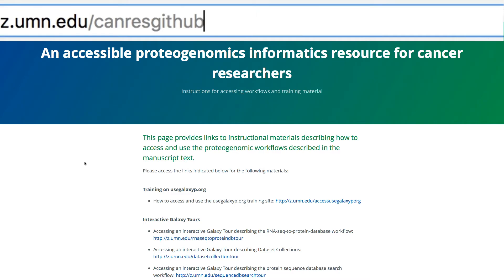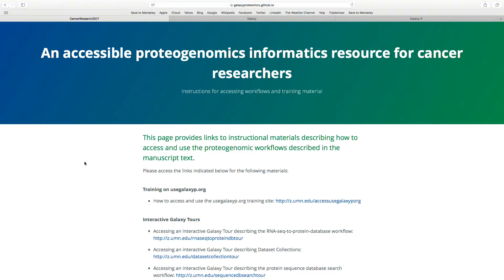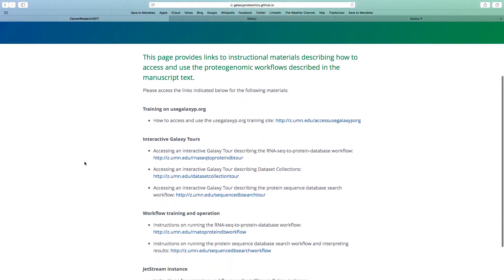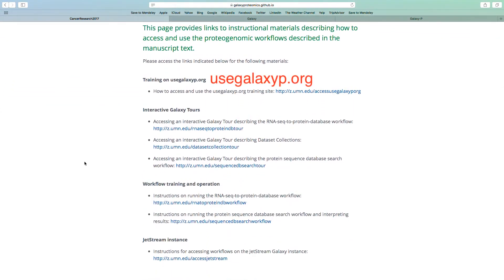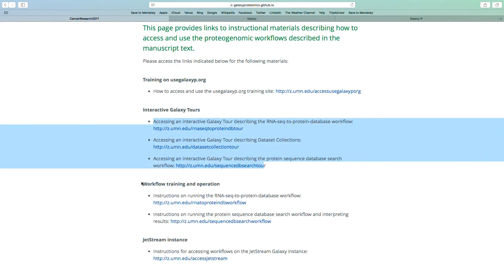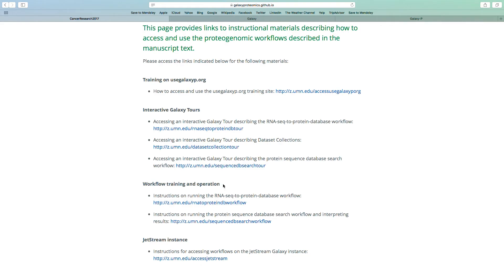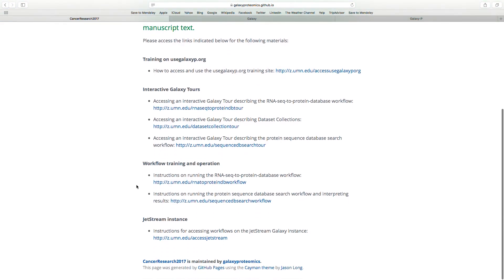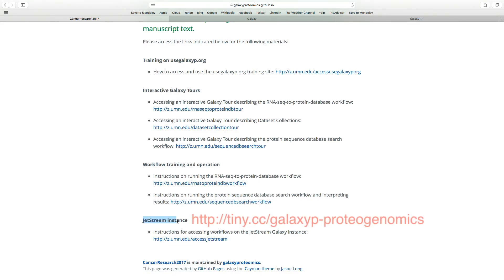We now return to the summary page with instructions on using our resource. On this page, you will find links to a publicly accessible training site at usegalaxyp.org. This site is meant for training and testing of workflows using small-scale data which we have provided. We have also created interactive Galaxy tours that explain our core workflows, as well as instructions on accessing and operating the proteogenomic workflows. We have also created an instance on the publicly accessible cloud-based cyber infrastructure called Jetstream.